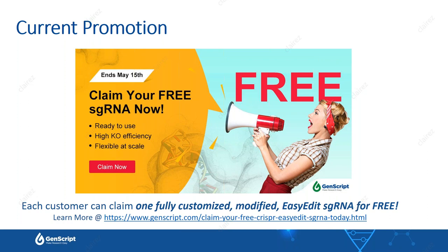So the first question we have is, is the high editing efficiency associated with the high transduction efficiency for virus? I believe so, yeah. It is because you can get such a high transduction efficiency that you get such high editing efficiency.